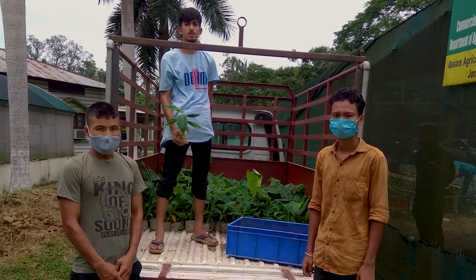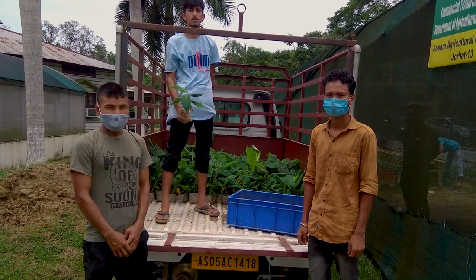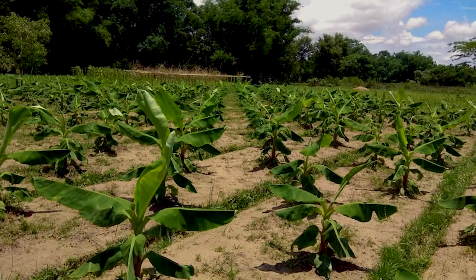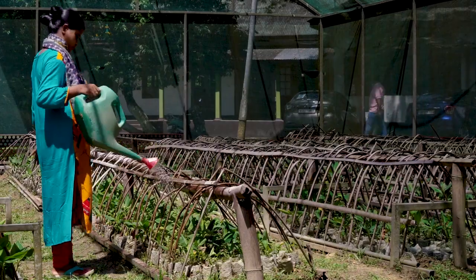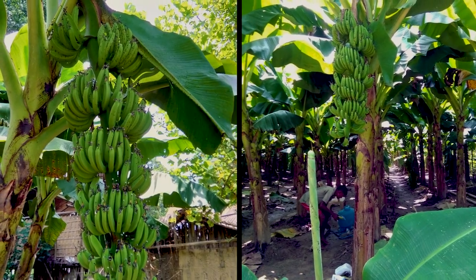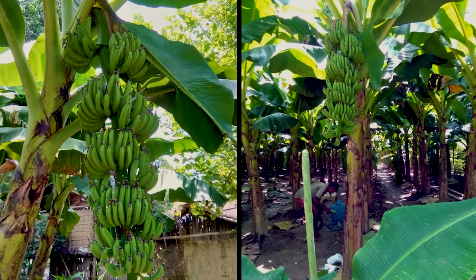We recommend only properly hardened plants to the farmers because growing properly hardened plants will give good results. The advantage of growing tissue culture plants is that the plants are available throughout the year and these plants are disease free. There are no diseases as these are grown under totally aseptic and very controlled conditions. So these are totally free from diseases caused by various microorganisms.